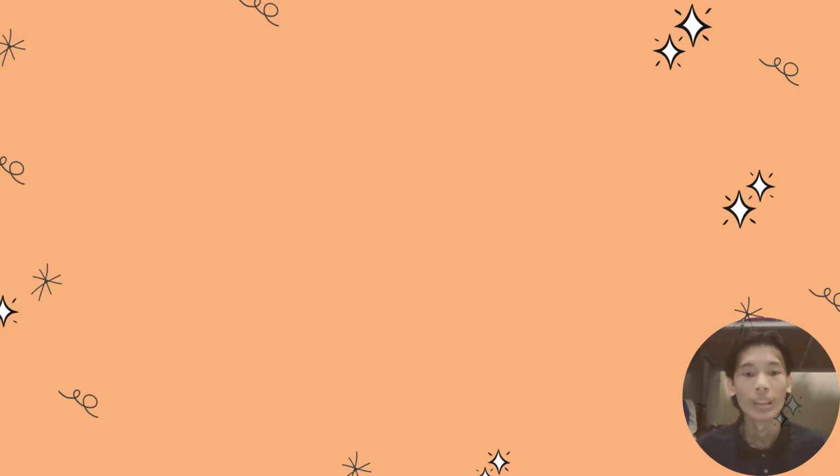Finally, indicator and accuracy. For the endpoint, the selected indicator should change color very near to the equivalent point. This is a physical observation that tells us to stop. Theoretically, at the equivalent point, we can calculate the precise amount of titrant required to react exactly with the analyte. So, the endpoint is what we see, guided by an indicator, while the equivalent point is the exact chemical completion point. A good choice of indicator helps ensure that the endpoint is as close as possible to the equivalent point, giving us accurate titration results.